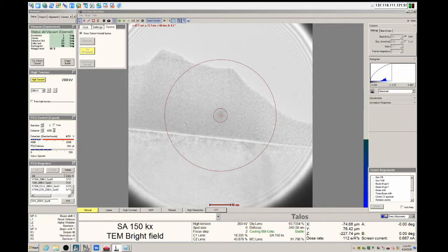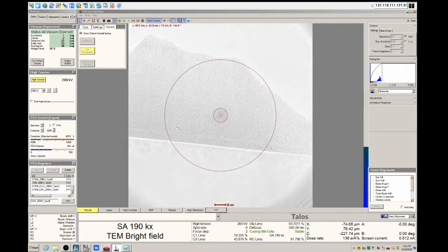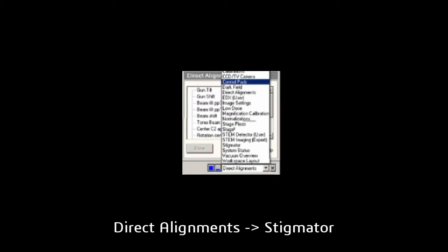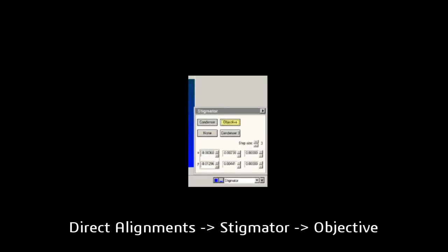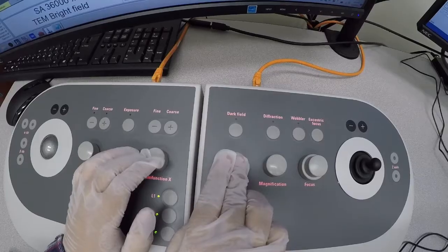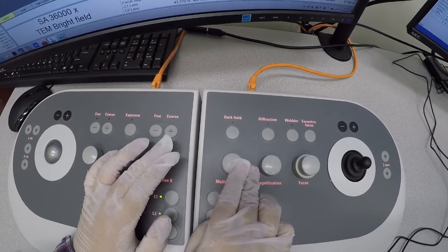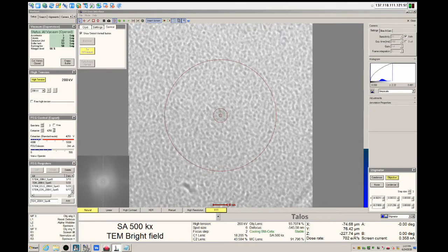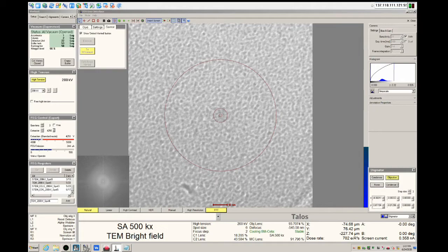Continue magnifying. The final alignment is the objective stigmator, found under direct alignment stigmator. Click objective. You can copy the current alignment position X and Y coordinates into location 2 or 3 for your record so that you can easily return to them later. The goal is to use the multifunction X and multifunction Y dials to make the Fourier transform of the image as symmetric as possible. It's a little tricky to tell, as you can see here on the phosphor screen.